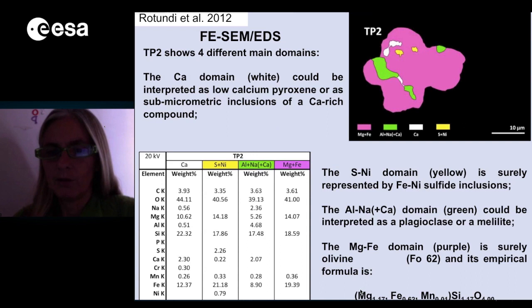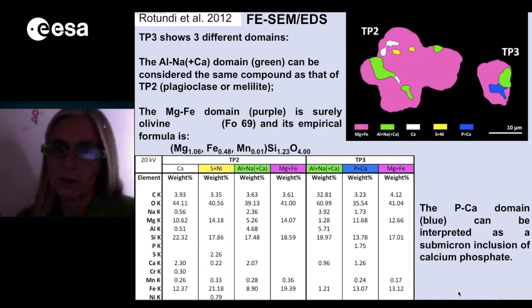And then again, for the second domain, we could reconstruct the composition by a combination of field emission scanning electron microscope and EDX analysis. And I have to say that all these results were somehow confirmed by the other two techniques, infrared spectroscopy and micro-Raman spectroscopy.